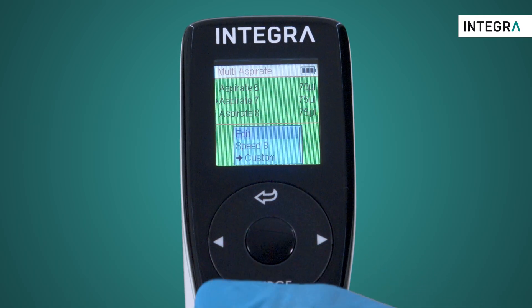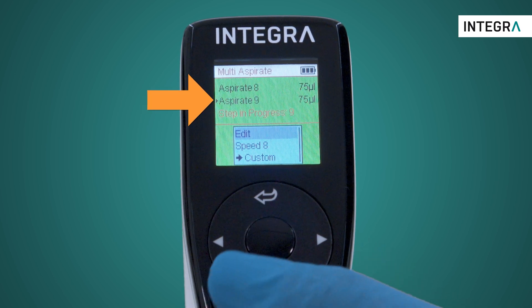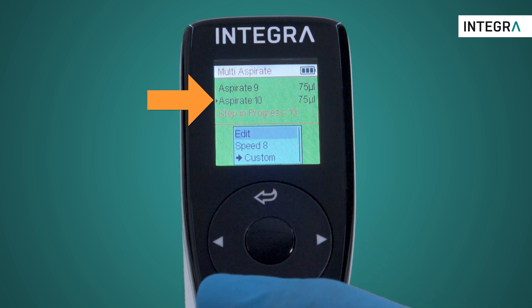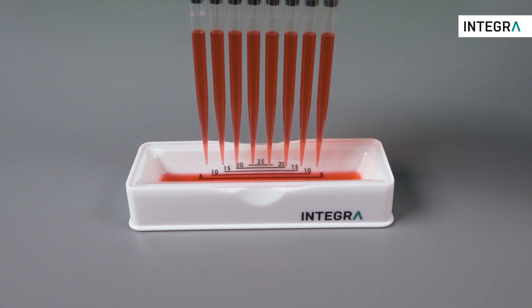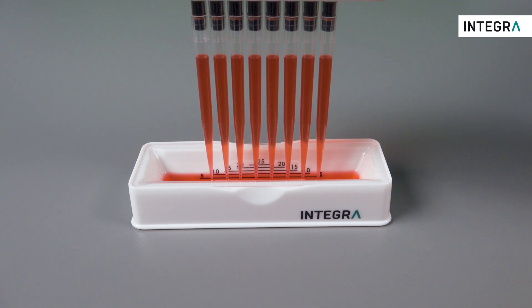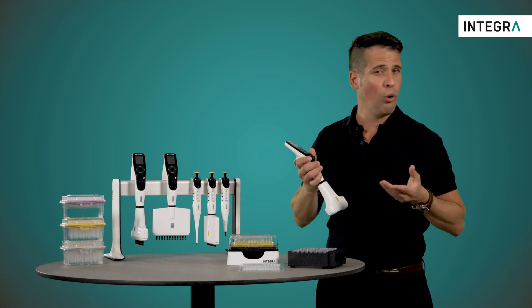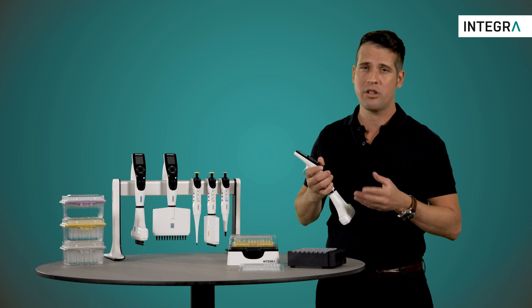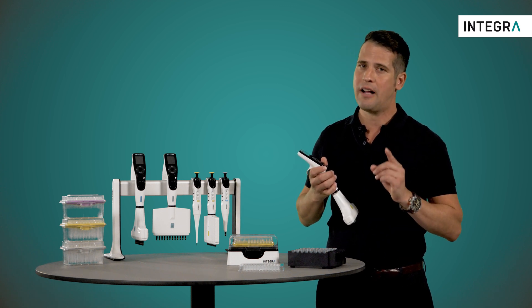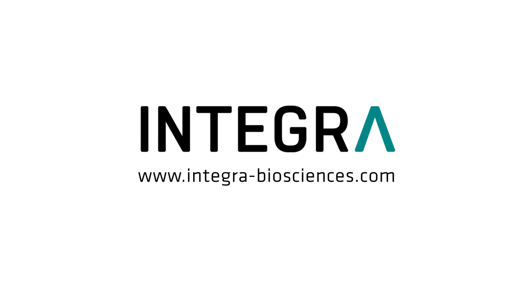Glancing at the screen always shows which aspiration number is next. The black highlighted step is the next which will happen when Run is pressed. Once all of the liquid has been aspirated, you can simply dispense the collected liquid into a container in one easy dispense. This mode makes really quick work of pooling or simply removing liquid back from containers such as 96-well plates or tubes, if you know the exact volume you wish to aspirate.